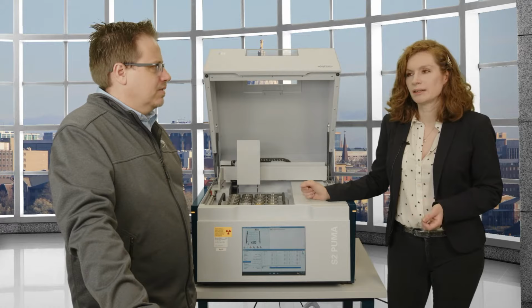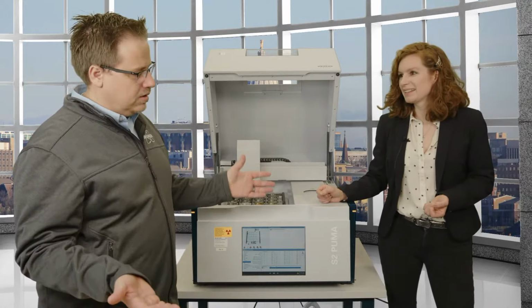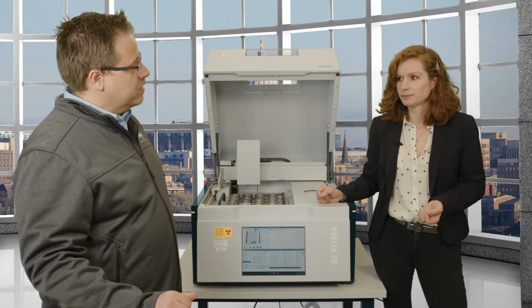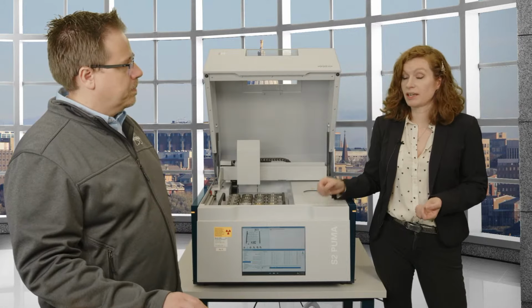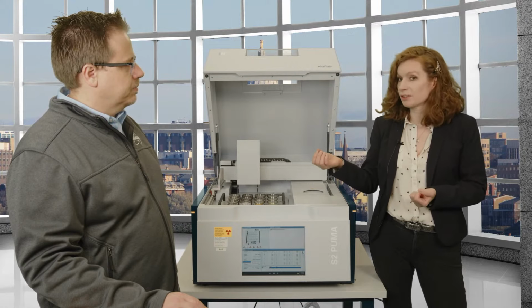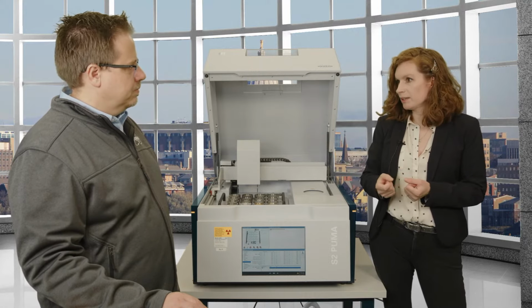I have to say the acronym is not very helpful. Well, I think it's historical, because of the systems you had. EDS are almost always on column on an SEM. But like you said, electrons in, and that's quite limited compared to X-rays in. Correct, because X-rays can go deeper into your sample, whereas electrons would stay at the surface. And because you have electrons, you have to measure in vacuum. If it's connected to an SEM, it's small, right?